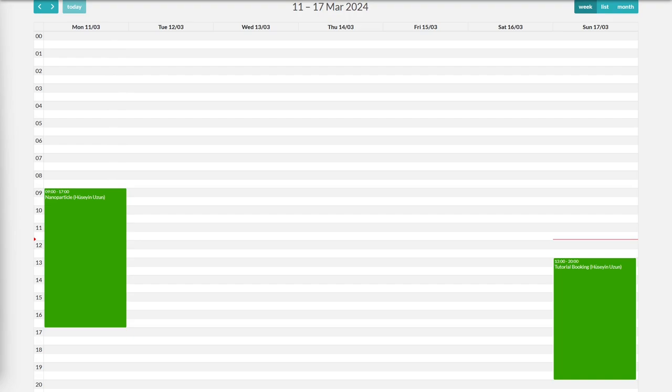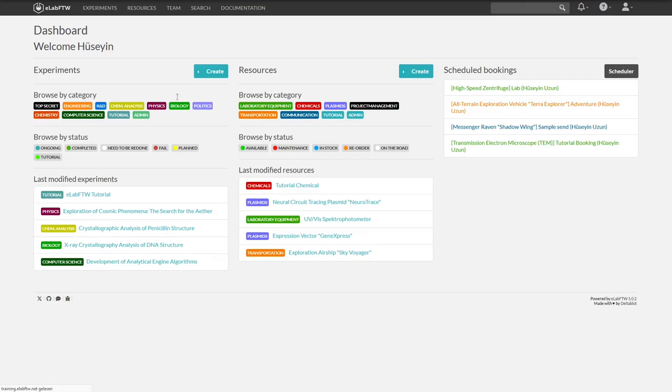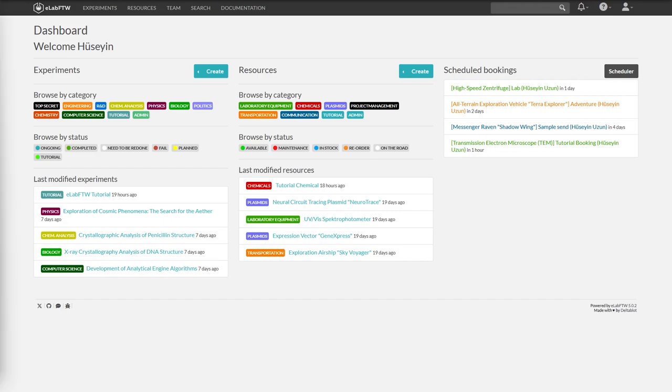If we go back to the overview, we can now see our booking. We can also now see it on the dashboard as an upcoming booking.